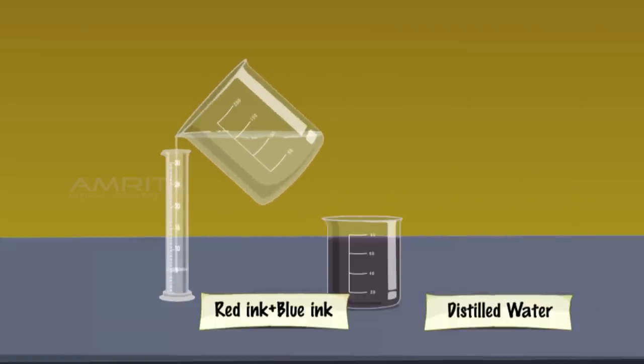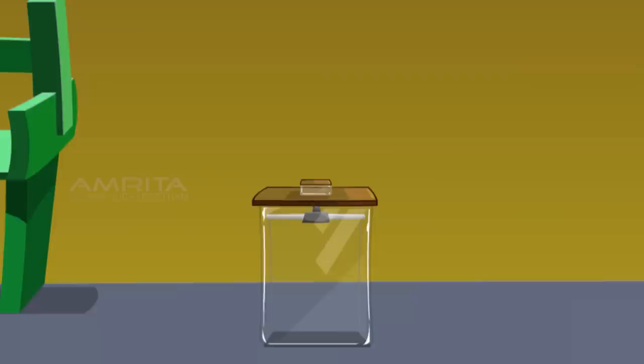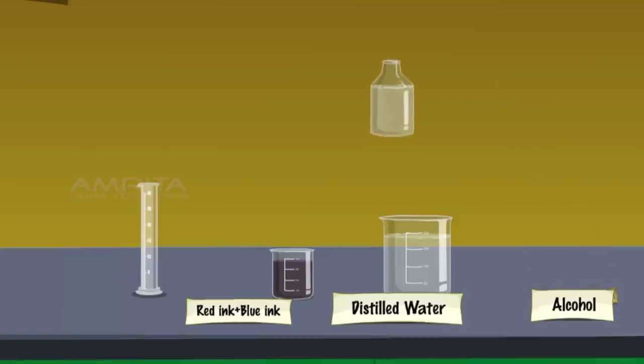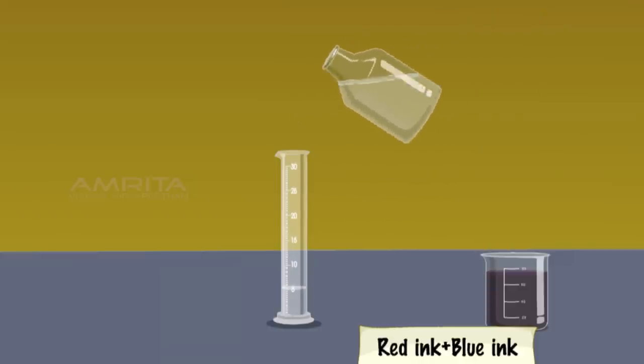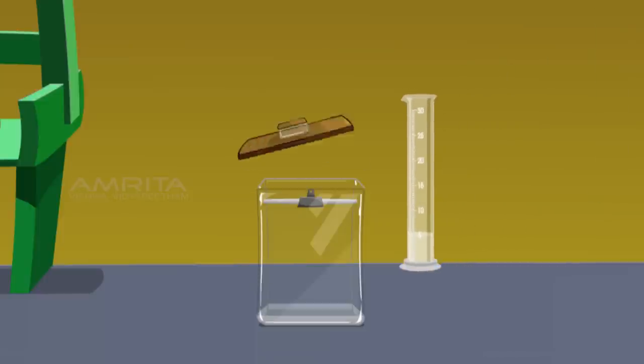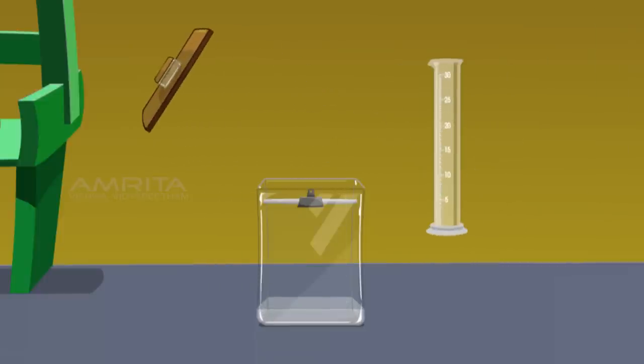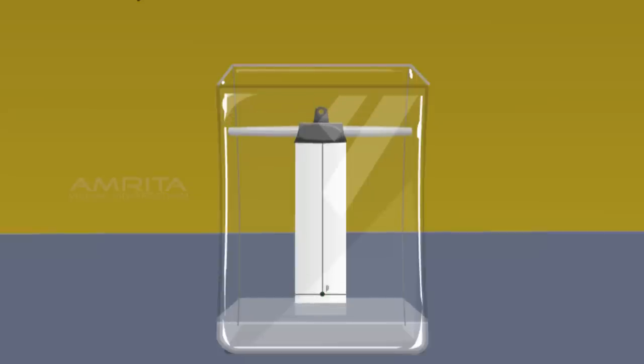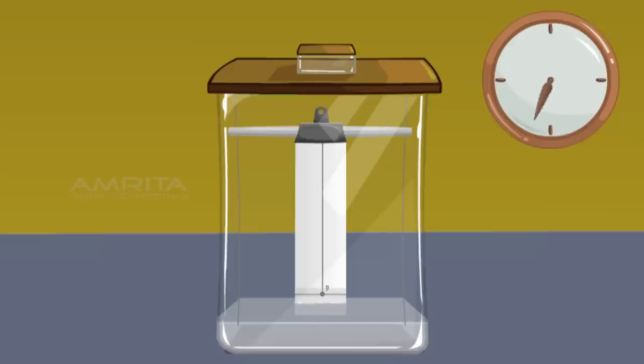Take 5 ml of distilled water in a measuring cylinder and pour it into a chromatographic chamber. Then take 5 ml of isopropyl alcohol in a measuring cylinder and pour it into the chromatographic chamber containing distilled water. Mix the contents of the chromatographic chamber using a glass rod. This mixture is used as the solvent. Suspend the filter paper vertically in the chromatographic chamber so that the pencil line remains about 2 cm above the solvent level. Close the chamber and keep it undisturbed for some time.